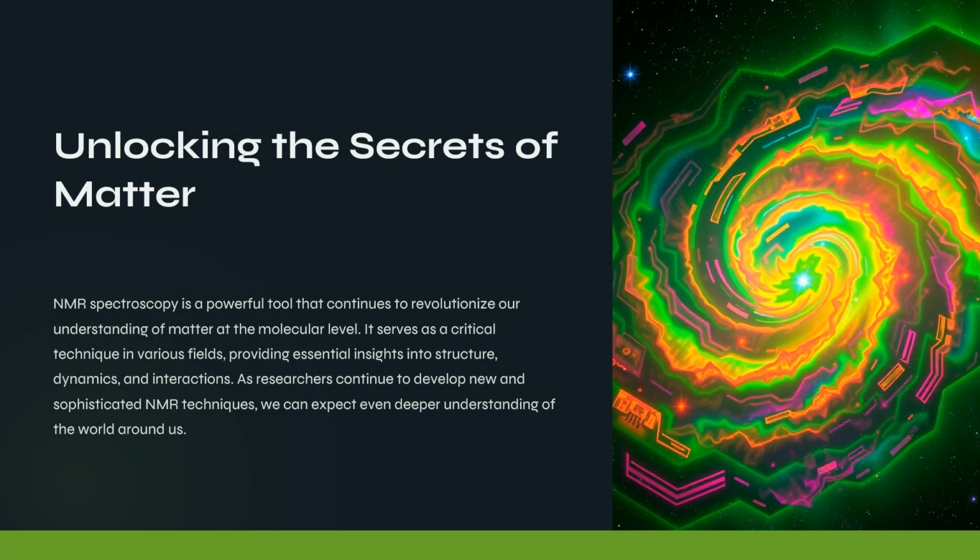As we wrap up, let's reflect on the significance of NMR spectroscopy in our quest to understand matter at the molecular level. NMR is a powerful tool that has revolutionized how we explore the structure, dynamics, and interactions of molecules. By allowing us to see the atomic details within complex substances, it plays a crucial role in various fields, from chemistry to biochemistry, and even in the pharmaceutical industry.